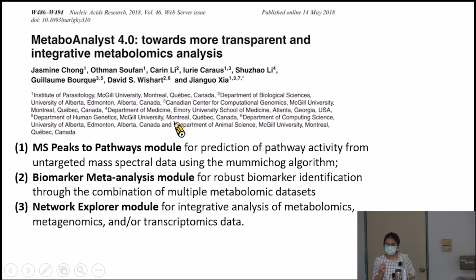But that's prediction, or are they validated by real samples? Some of the data validate this, but not all of them. So that's why we say that all of these metabolite analyses should be validated if you are really getting ready for food or for therapy.